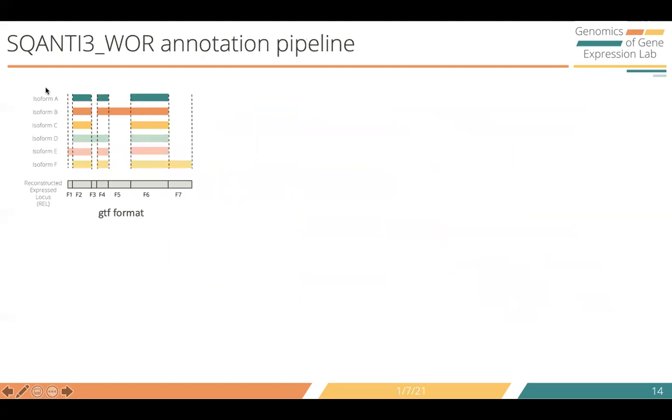Then in SQANTI, we map back the transcripts to these reconstructed express loci to identify fragments.